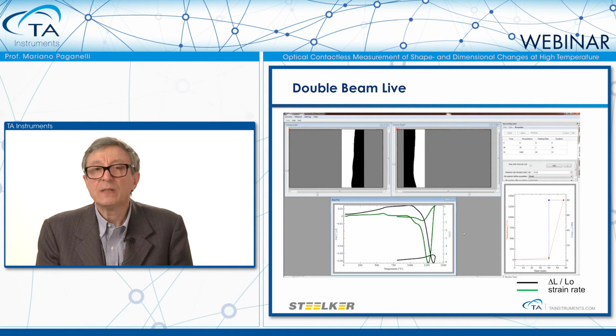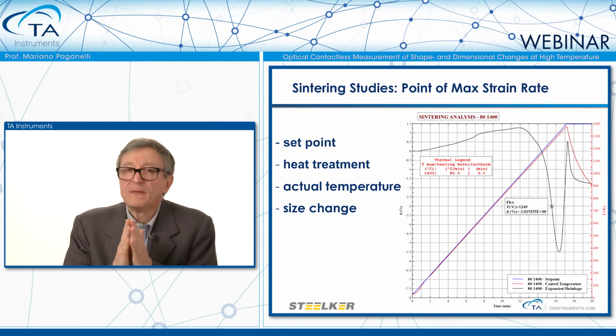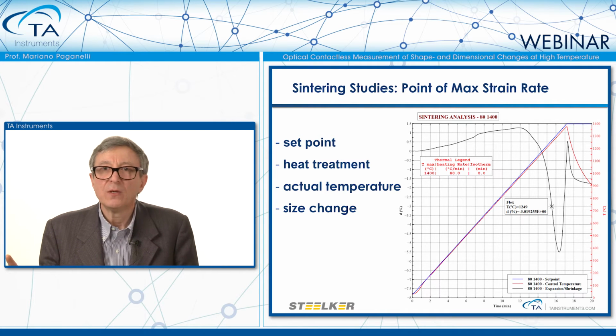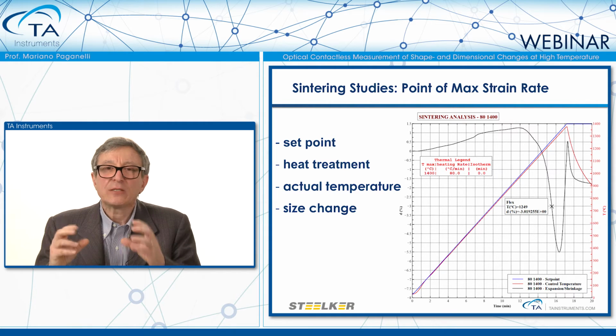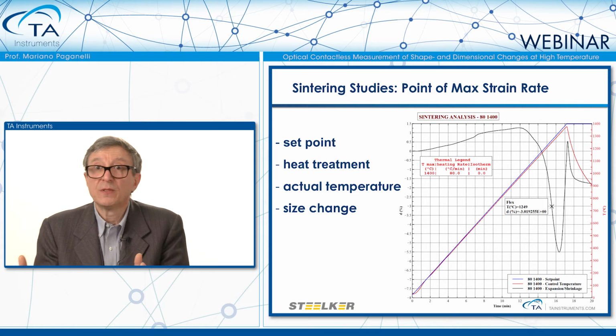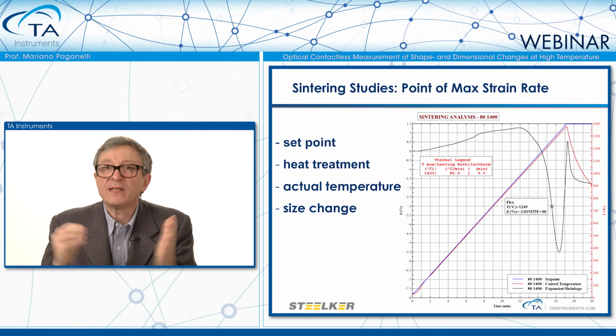Besides that, as you can see, while we are rising the temperature, the two surfaces are not flattening, they are becoming more and more rough. This machine, this technology, is invaluable in the study of the maximum strain rate. The maximum strain rate is the dream of ceramic scientists. And in order to get close to that magic number, they run hundreds of tests because they must approach this, but they cannot reach it, because if they reach it, the push rod dilatometer is showing fake numbers.